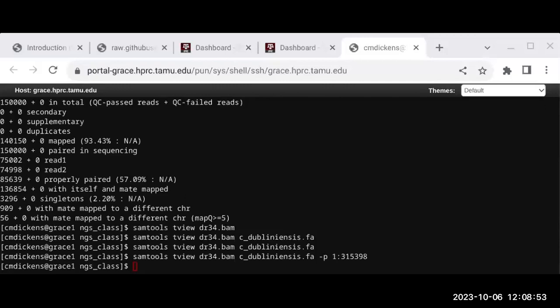Again, if you see a tool that's not there that you need to use, let us know. Most of the time we can install it. Very rarely it's not able to be installed. Sometimes it's because it's a Windows-only tool. It's rare that it's a Windows-only tool, but sometimes it just doesn't work on the cluster, but that's rare.